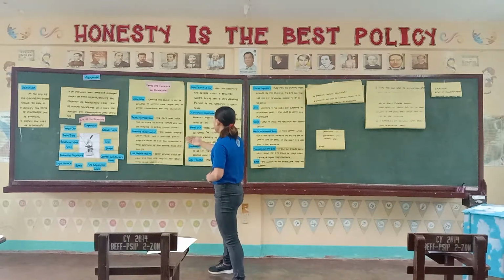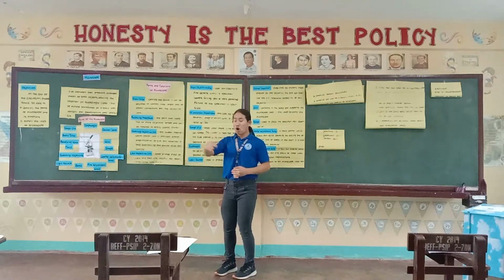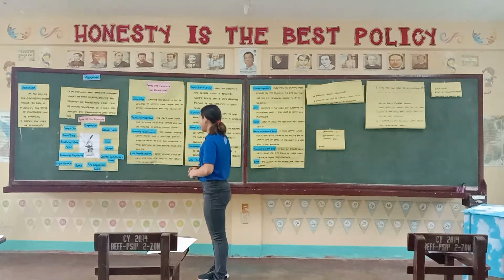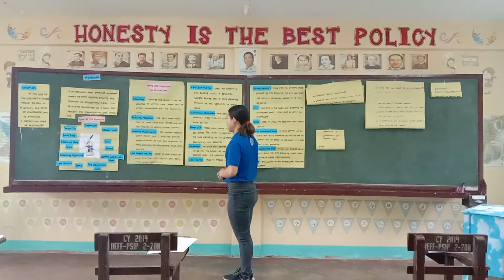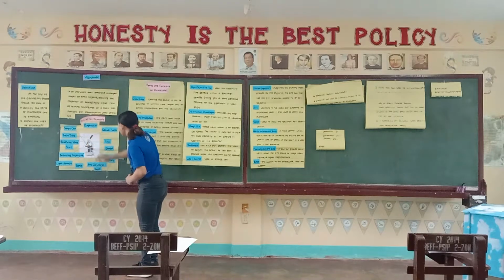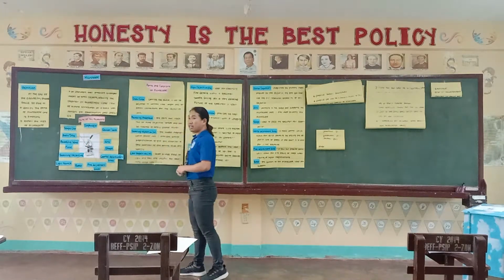So it can provide only enough magnification to give an overview of the structure of the cell. Alright, so now let's move on to the low objective, which has 10 times magnification. Over here are the lenses, the different objective lenses. One of them is the low objective magnification.